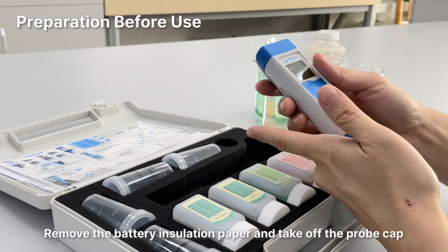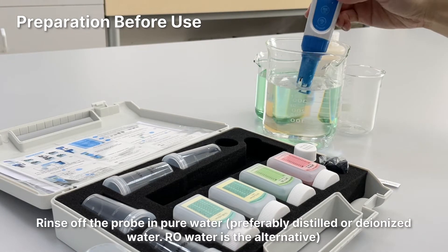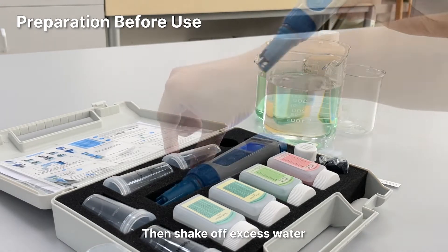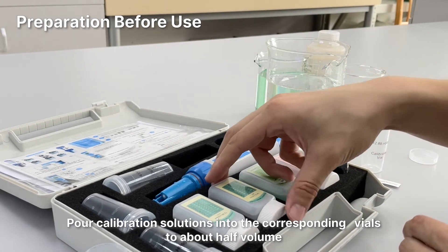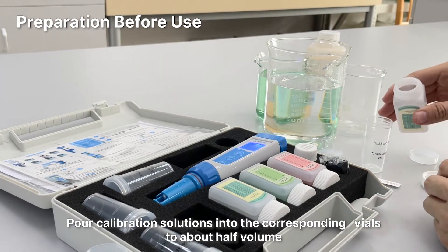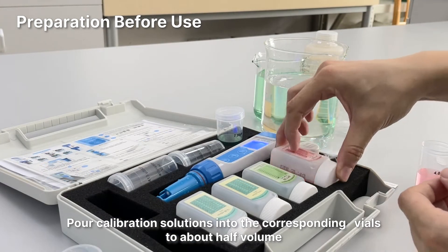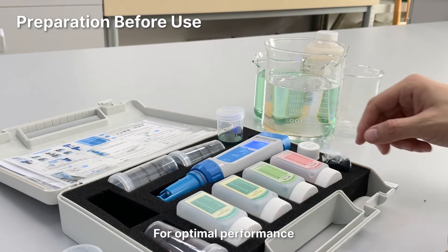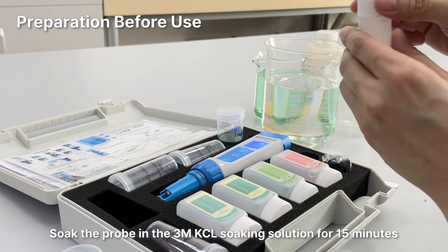Remove the battery insulation paper and take off the probe cap. Short press the power button to turn on the tester. Rinse off the probe in pure water, then shake off excess water. Pour calibration solutions into the corresponding vials to about half volume. For optimal performance, soak the probe in the 3M KCL soaking solution for 15 minutes.